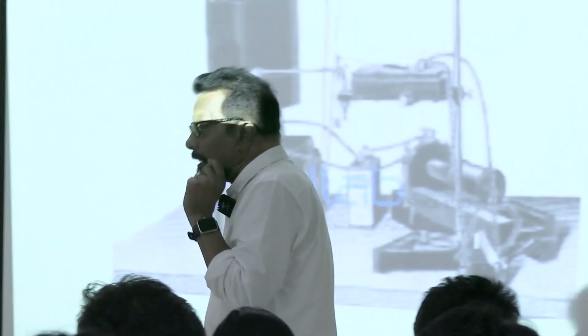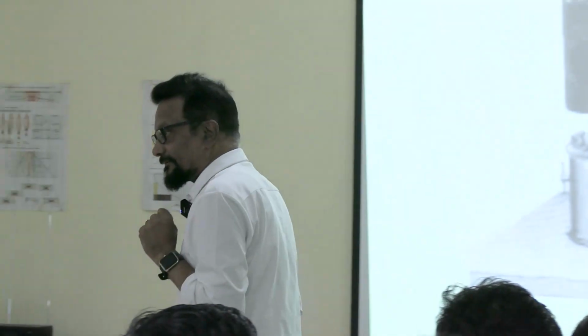We need about 4 to 5 volts of induced current. We don't want more than this, because that would not be appropriate and may damage the tissue. This is sufficient to stimulate the muscle and the nerve. So that is appropriate.